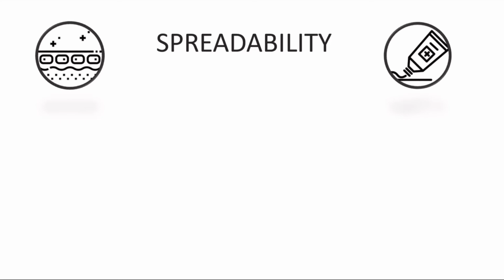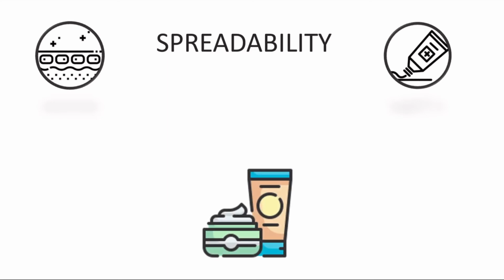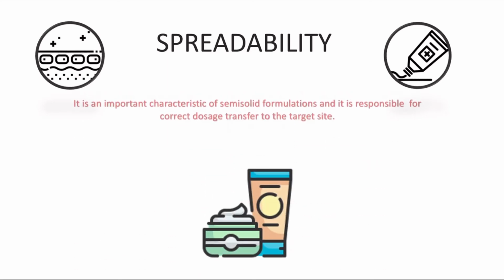It is obvious that the efficacy of topical therapy depends on the patient spreading the drug formulation in an even layer to administer a standard dose. Therefore, spreadability is an important characteristic of semisolids, and it is responsible for correct dosage transfer to the target site.